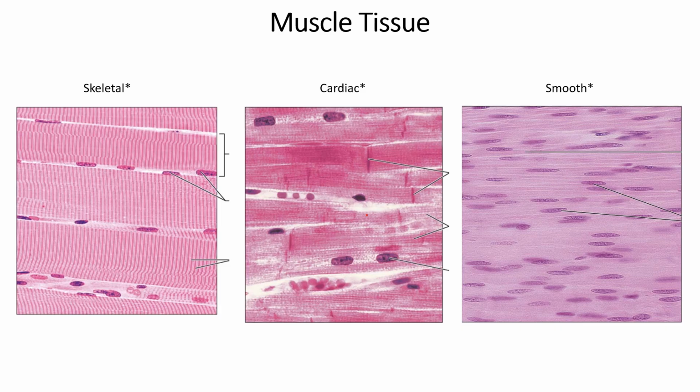It may be easy to confuse this with epithelial tissue, but remember, epithelial tissue is always going to have connective tissue underneath it or around it in some way, right? Since we are just seeing rows and rows of elongated cells here with flattened nuclei inside, don't mistake this for stratified squamous. If it were stratified squamous, we would see, maybe down here at the bottom or somewhere here, they would have shown us the connective tissue surrounding it.